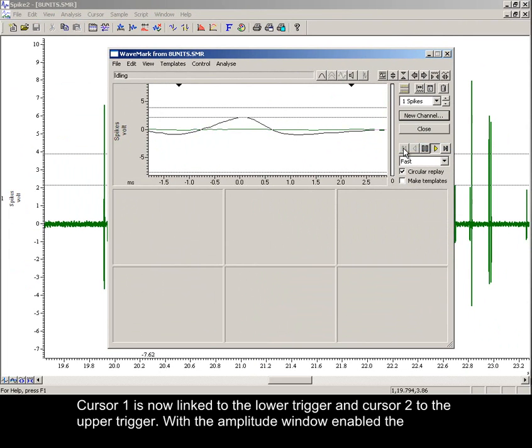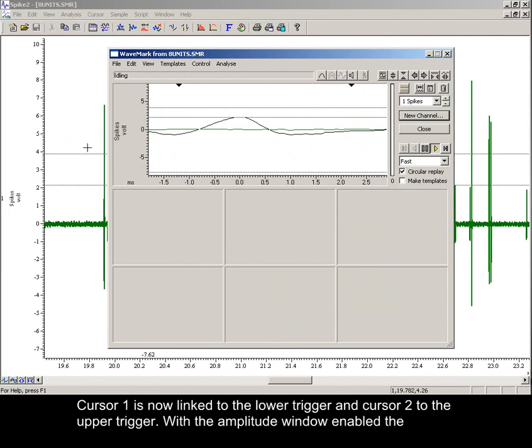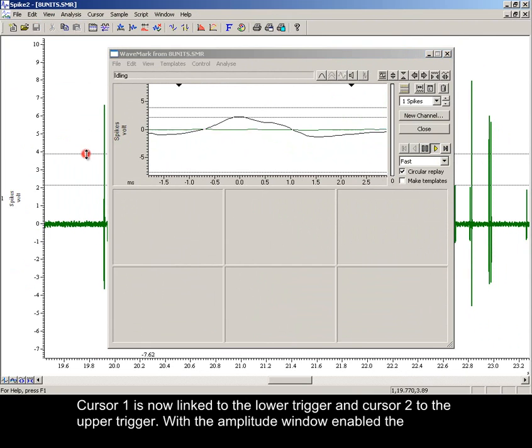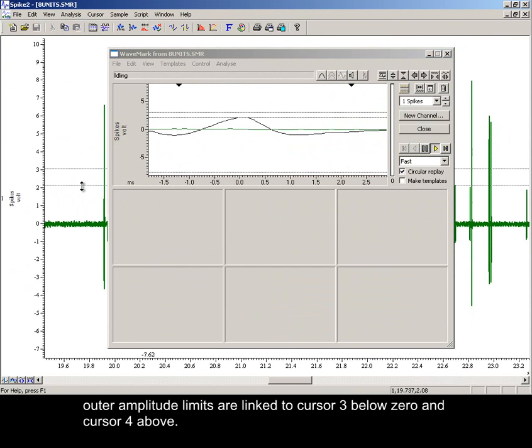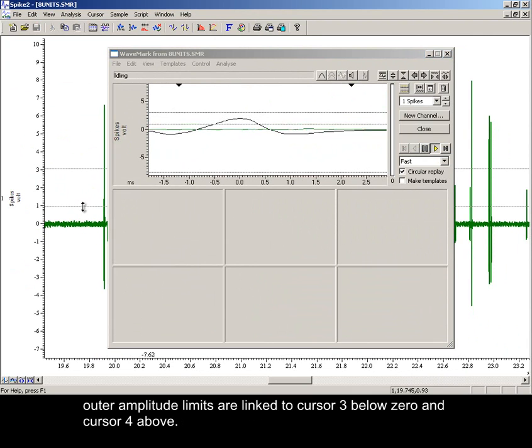Cursor 1 is now linked to the lower trigger and cursor 2 to the upper trigger. With the amplitude window enabled, the outer amplitude limits are linked to cursor 3 below zero and cursor 4 above.